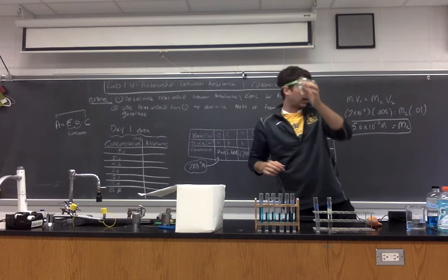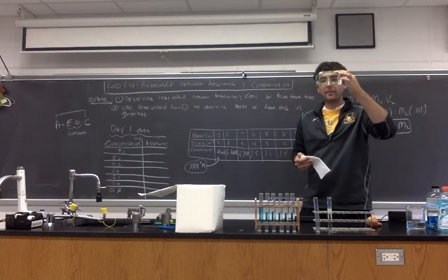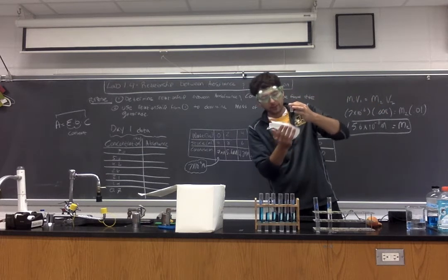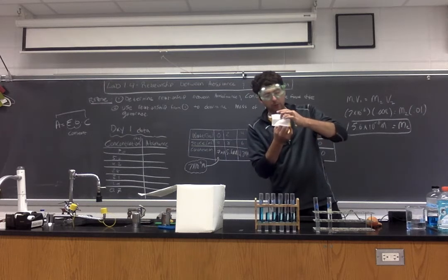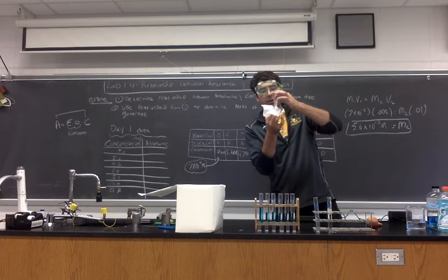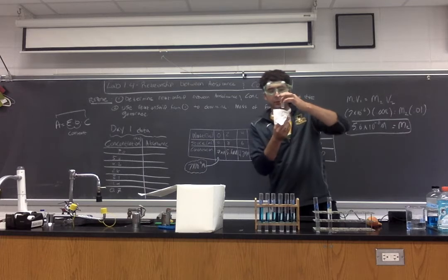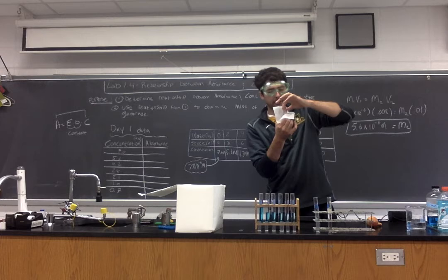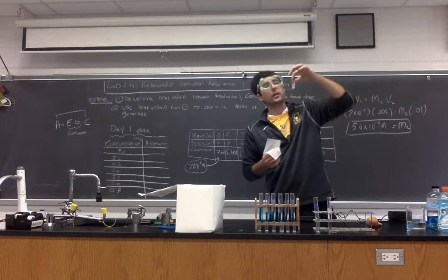The colorimeters are very sensitive. So, if you have any sort of smudgy fingerprints on your cuvette, that will impact our reading or our results. So before we put this into the device, I'm using what's known as a Kim wipe to wipe off any fingerprints that may be on the device. Now, if you were thinking logically, you'd be saying, Mr. Rice, you're holding the device with your fingers, so aren't you adding fingerprints right now?